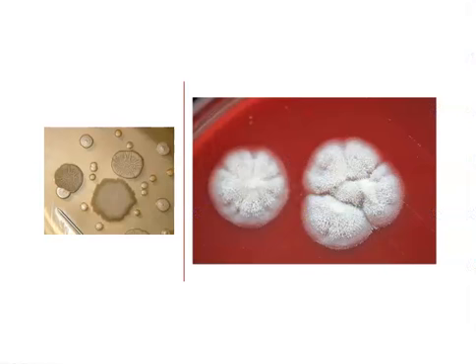So, very important for us to remember that just by looking at colonies growing on an agar plate, we can't say whether they're fungi or bacteria. If you look at this picture, for example, I could see 2 colonies growing on this blood agar plate. And boy, if I had to guess, I would guess that these are fungal. They look kind of fuzzy. They're not particularly symmetrical. They have that whitish sort of powdery look to them. Boy, I'll bet these are fungi.